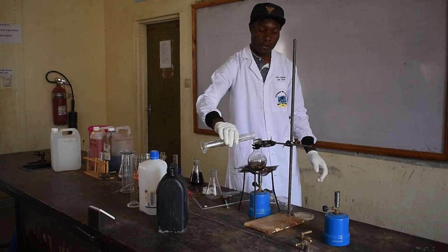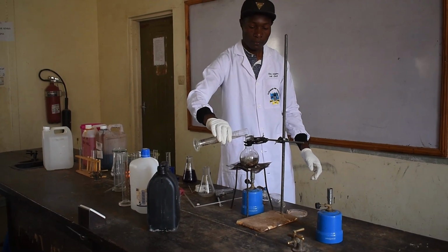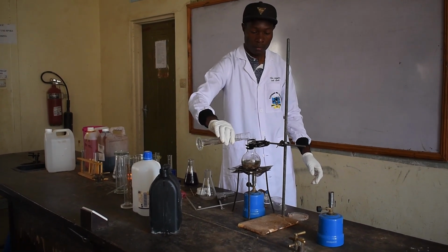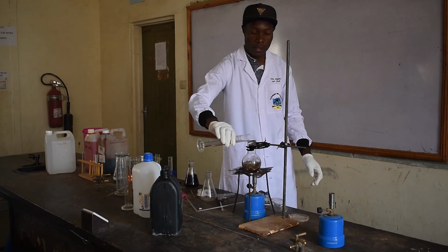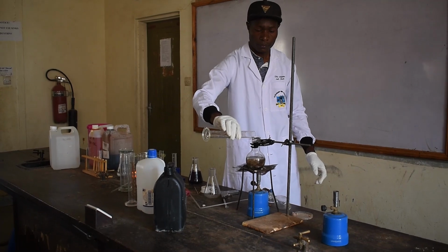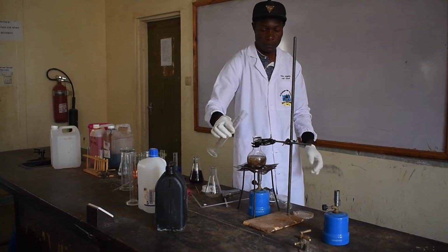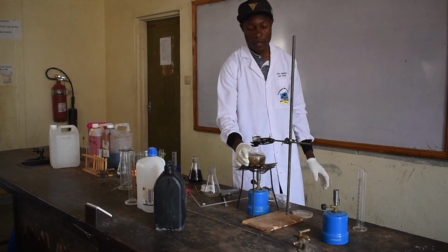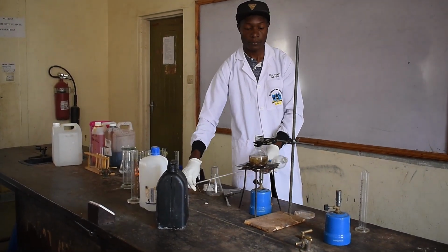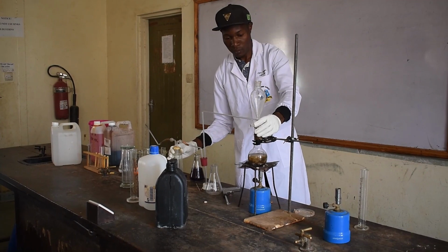The reaction is so explosive, so we expect some fumes. The reaction is exothermic. Now here in the round bottom flask, we have a mixture of sulfuric acid and ethanol.